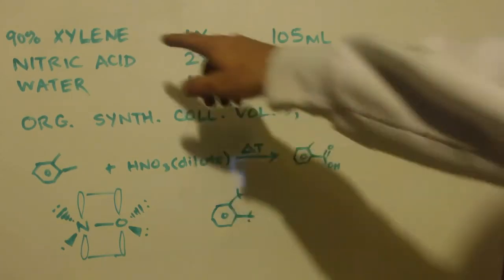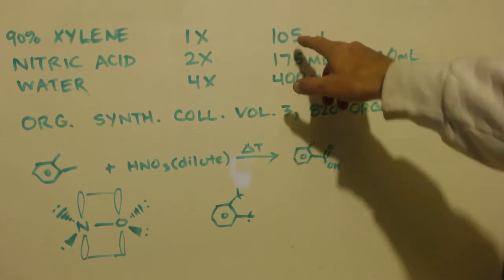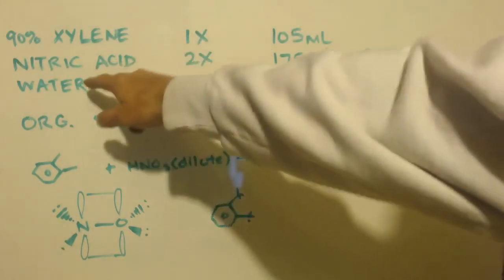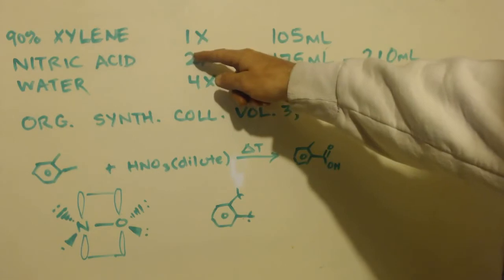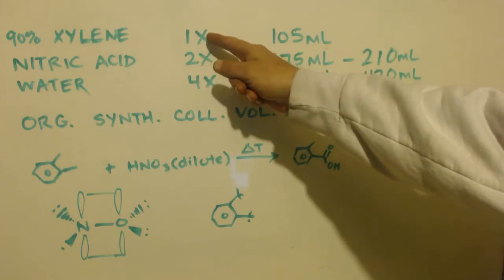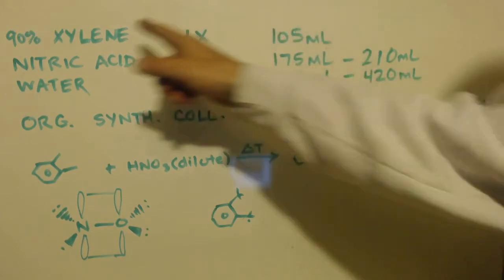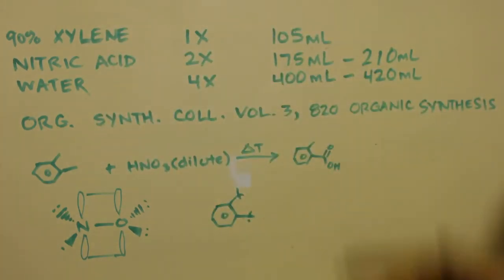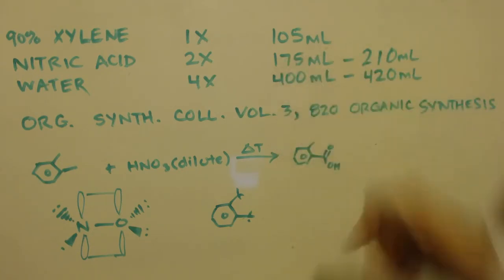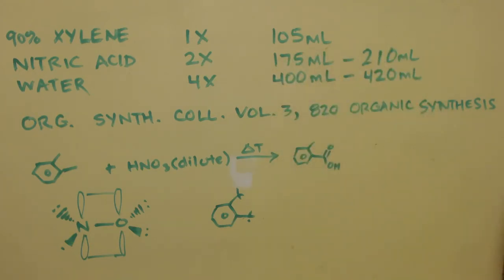Alright, there's the 3 things I put in. Here's another difference that I did. These should be doubled, okay? If you have 1x of xylene, you should put 2x of that, 4x of that. See how they keep doubling? So if I put 100 milliliters in, I should put 200 milliliters here and 400 milliliters here. I put 105 milliliters of the 90% xylenes. According to this theory, I should go up to 210 milliliters of nitric acid. I only put in 175. So I shorted myself 35 milliliters of nitric acid.